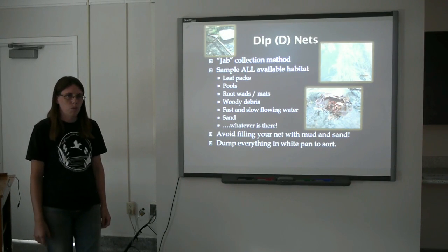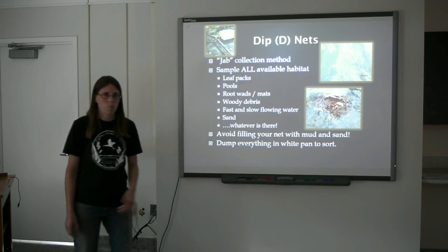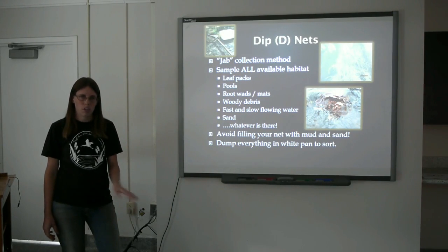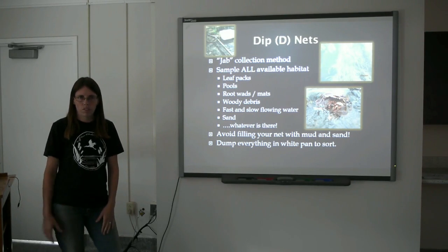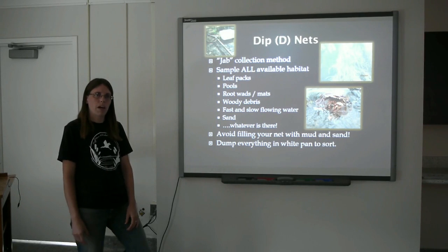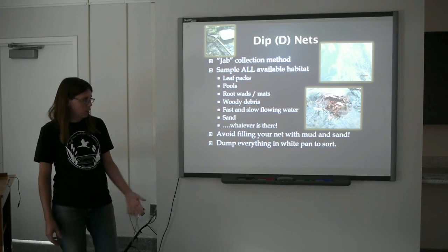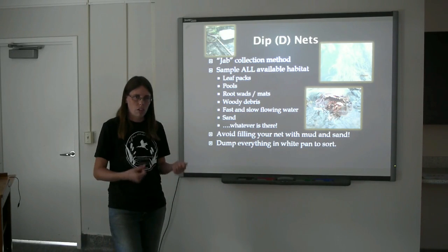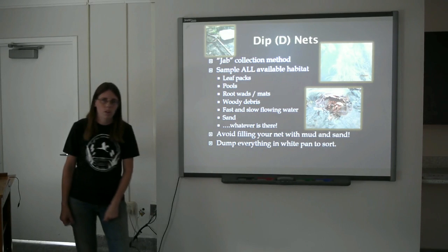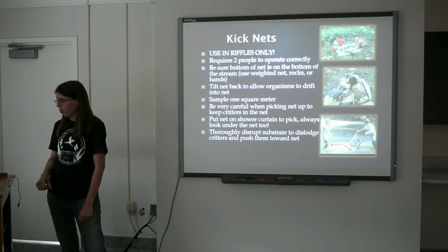An important thing to remember when you're sampling habitats, if you're sampling a reach that is mostly dominated by sandy bottom, and there's one large leaf pack, you don't want all of your samples to come from that one leaf pack. You'd also want to collect samples from the sand. Avoid filling your net with mud and sand, and then once you have your sample collected, you would dump that into a white pan to sort through it and find anything that was in the sample.